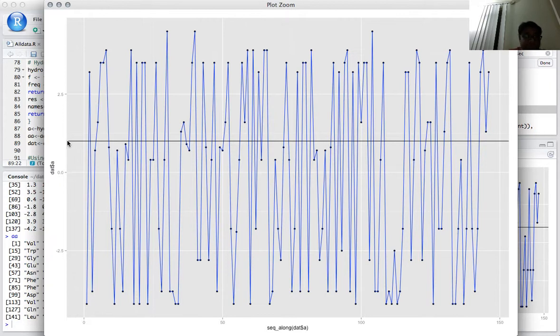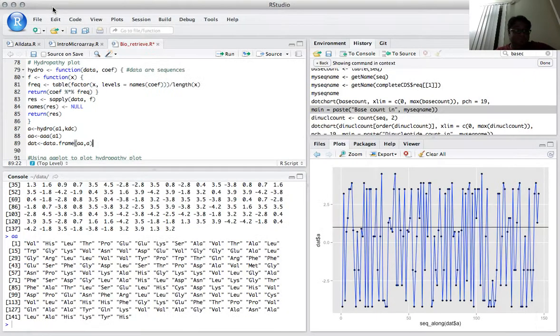The one is kind of a standard measure. If your protein shows this region, mostly if you see, this region is a hydrophobic region, this one is hydrophilic, this one is a strongly hydrophobic region. So there you can get the sequence elements which show hydrophobicity.